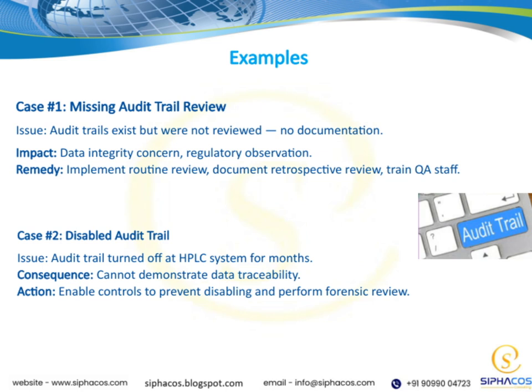Additionally, performing a forensic review is essential to understand what may have happened during the period when the audit trail was turned off. Now, moving on to case number 1, which concerns a missing audit trail review.